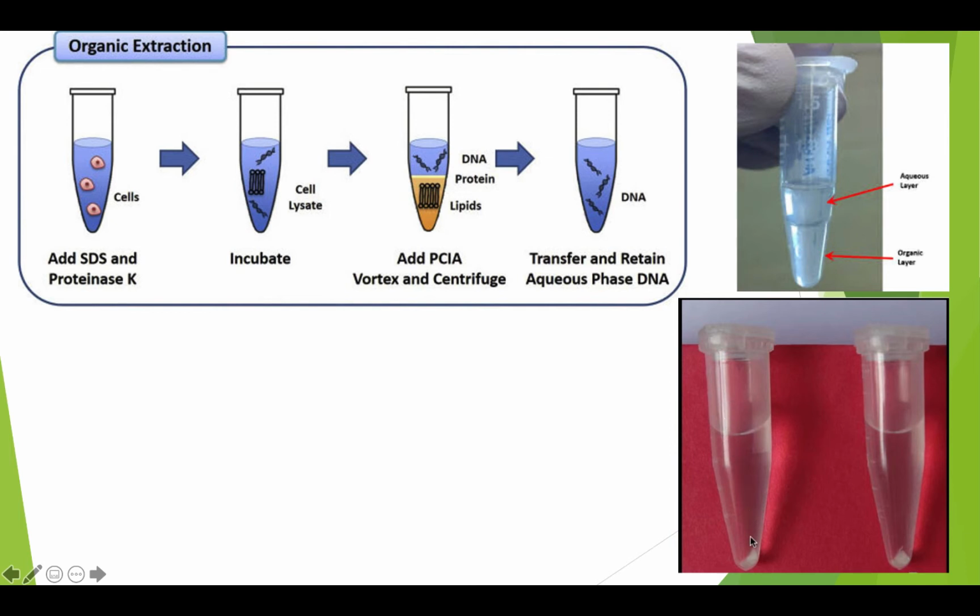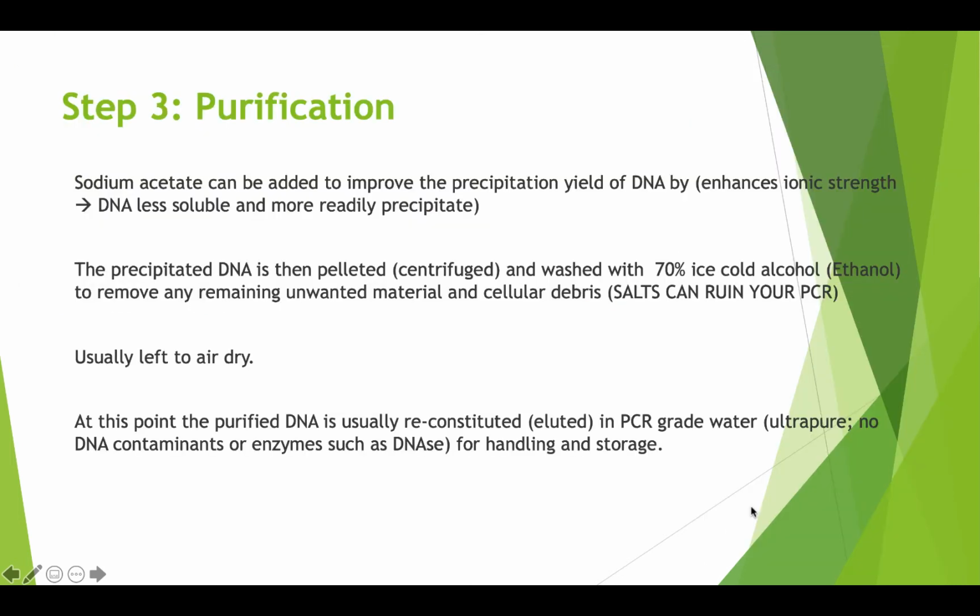Even if DNA falls, there will be small remnants of DNA. You can still at least do a PCR. It won't all go, not all of the DNA disappears, because DNA is a very strong contaminant. If you want to do PCR, PCR will pick up even one template, even one strand of DNA, and then amplify it. So that's why it can easily contaminate tubes. But the pellet usually is strong enough, and you can do the second step, which is purification.